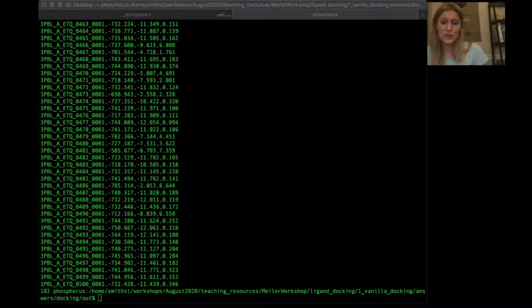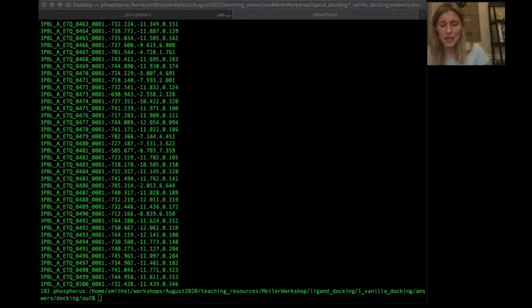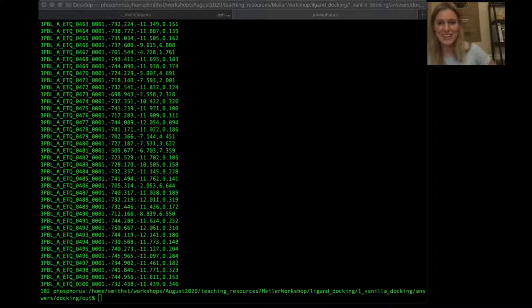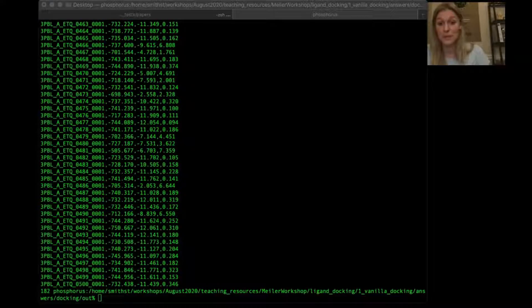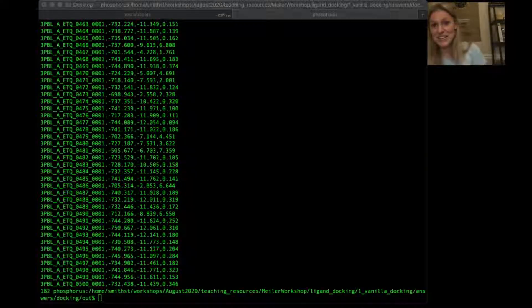With that, I hope you've learned how to do this — at least the basic setup. Please feel free to ask questions. I know I'm not used to working on a terminal and recording at the same time, so let me know if there's anything I can clear up. Thanks, everyone — have a good time!